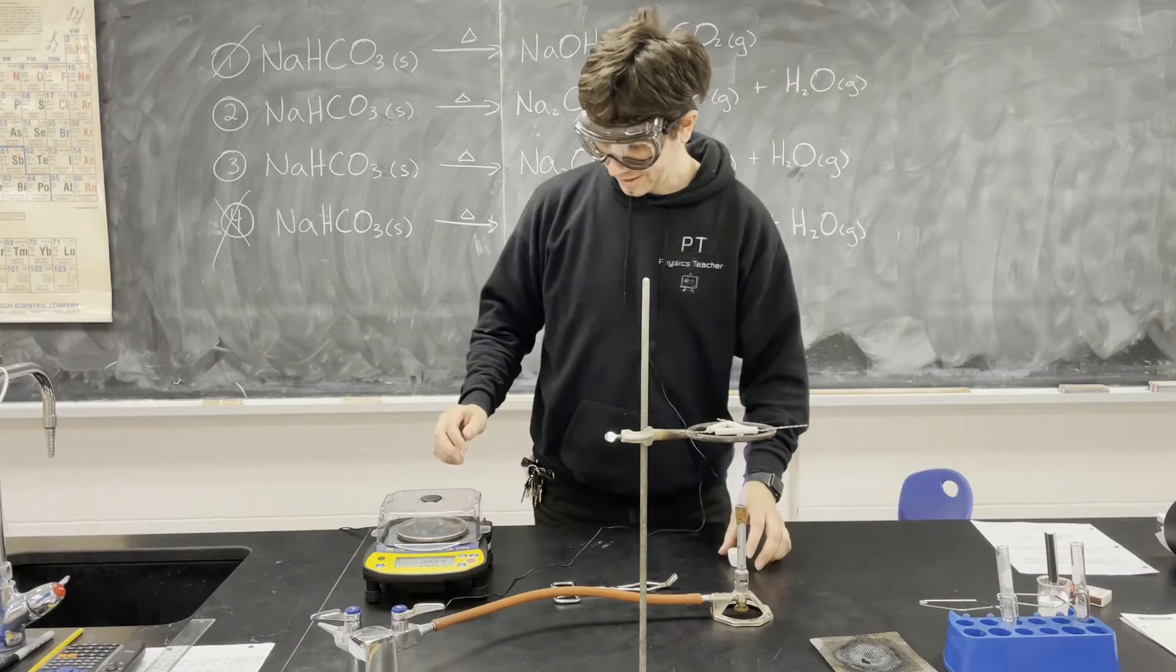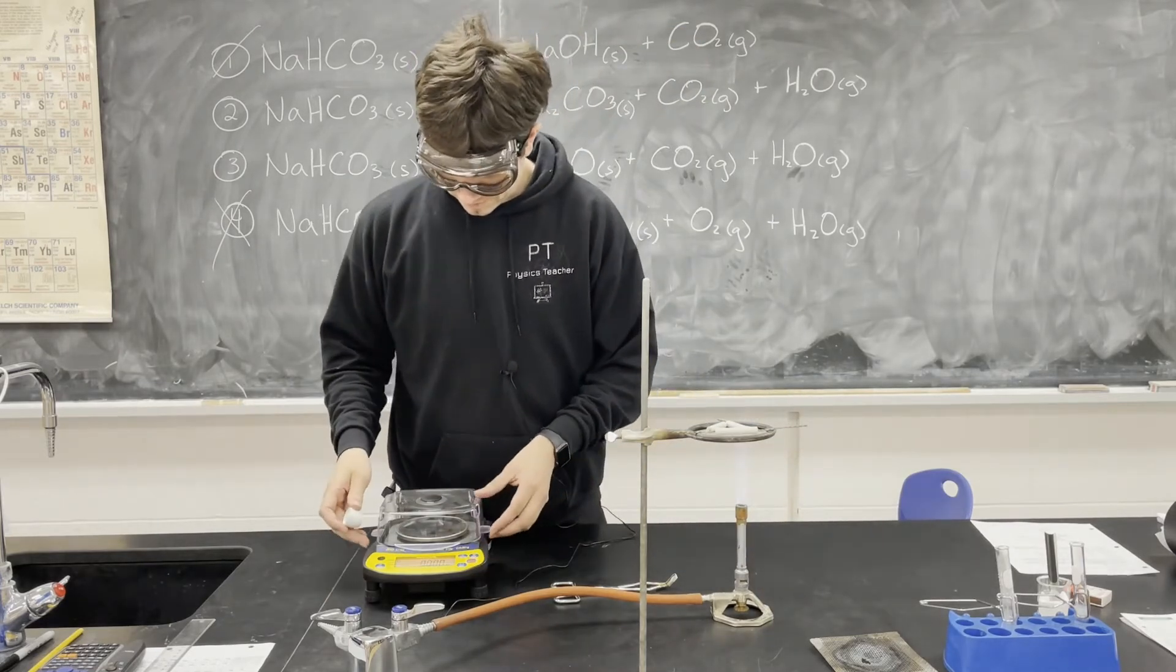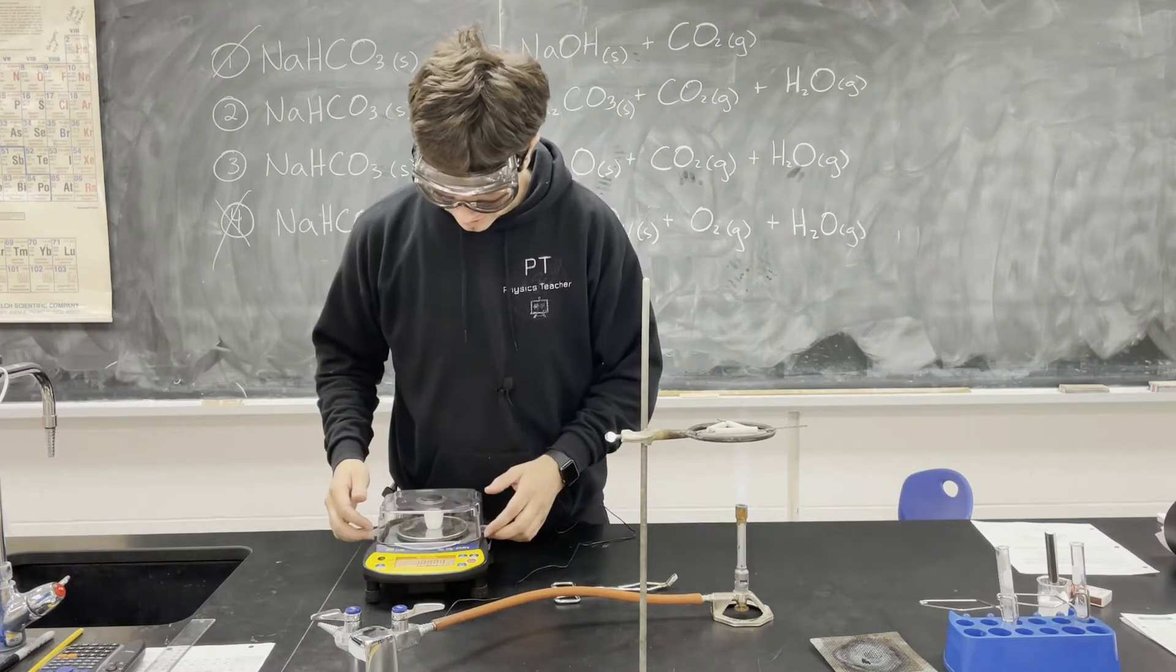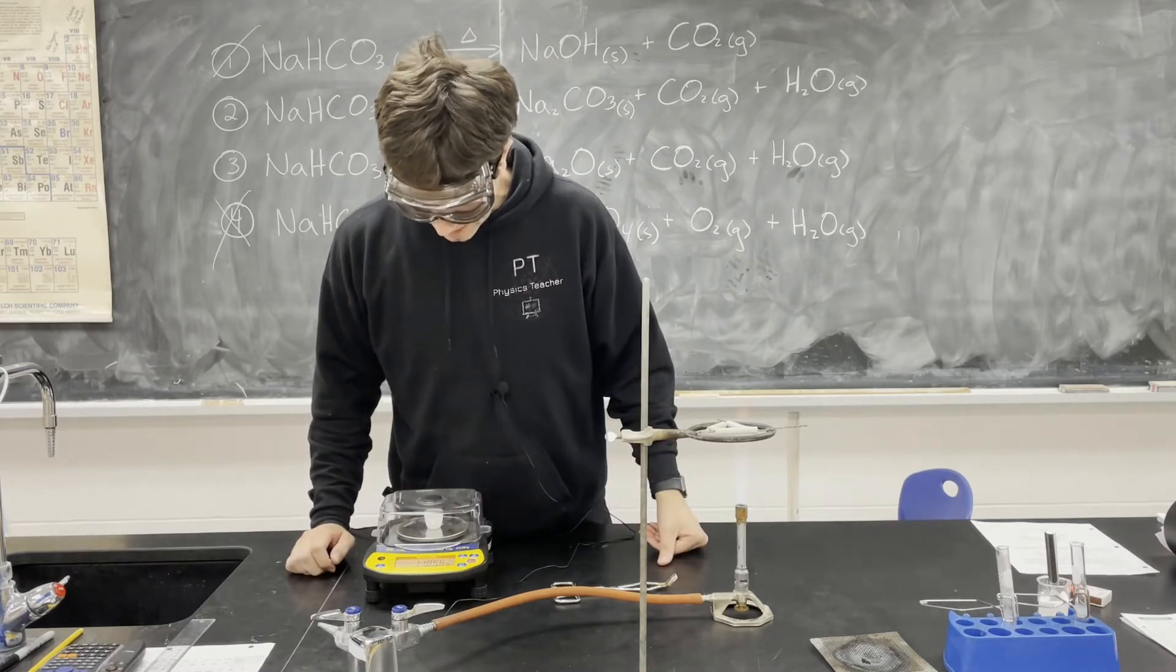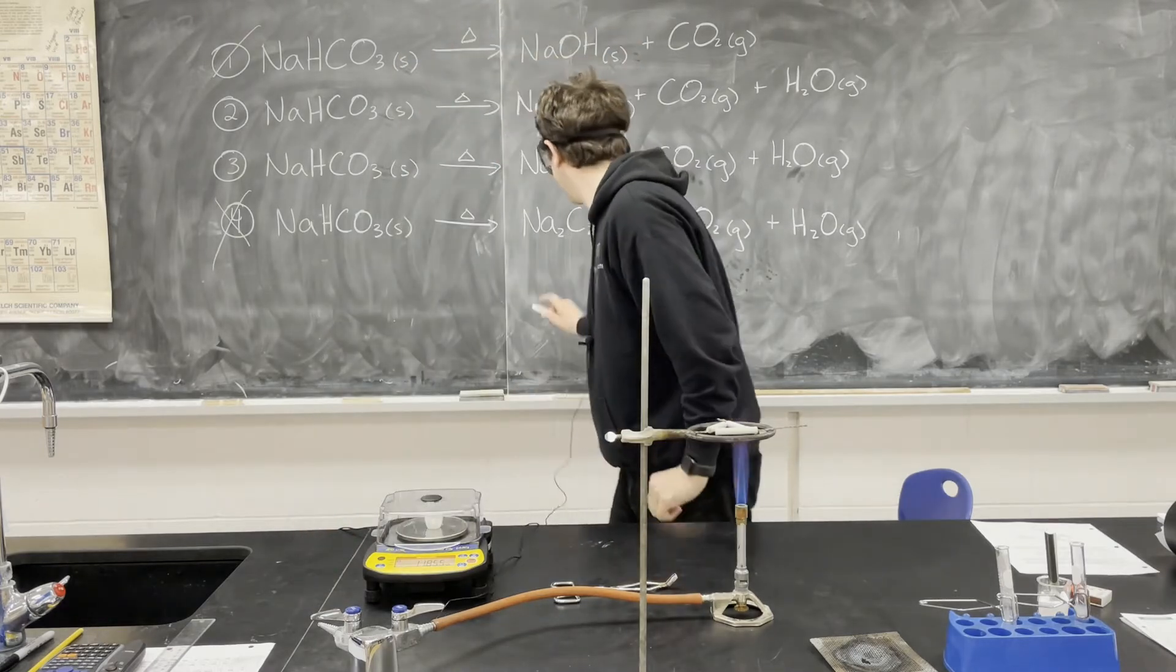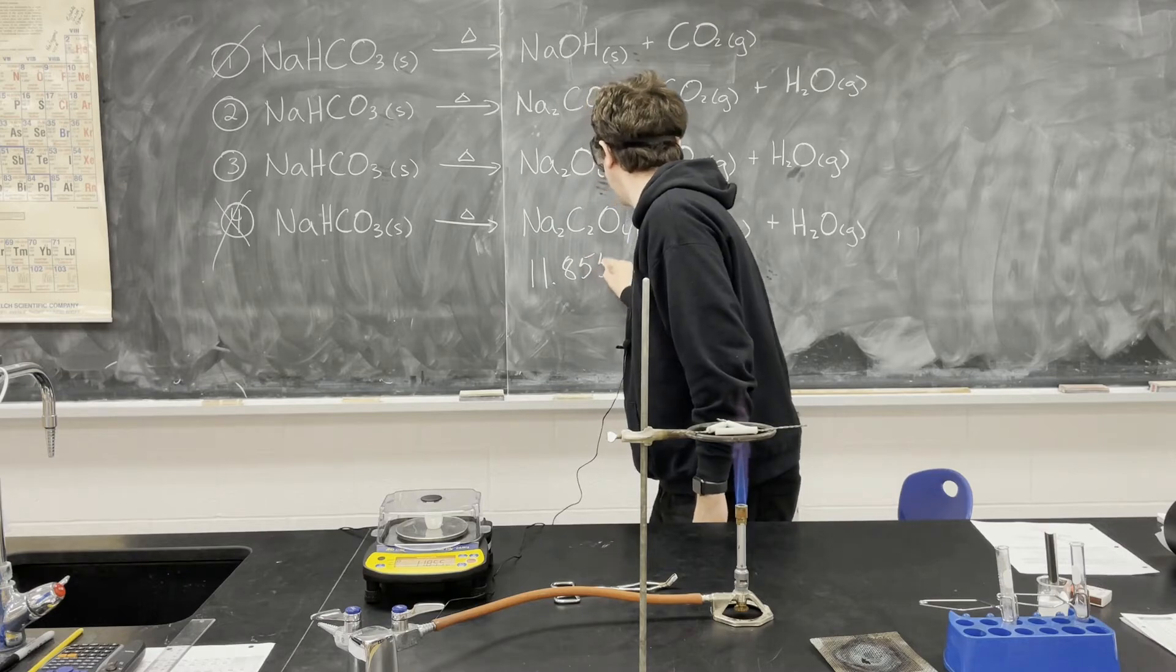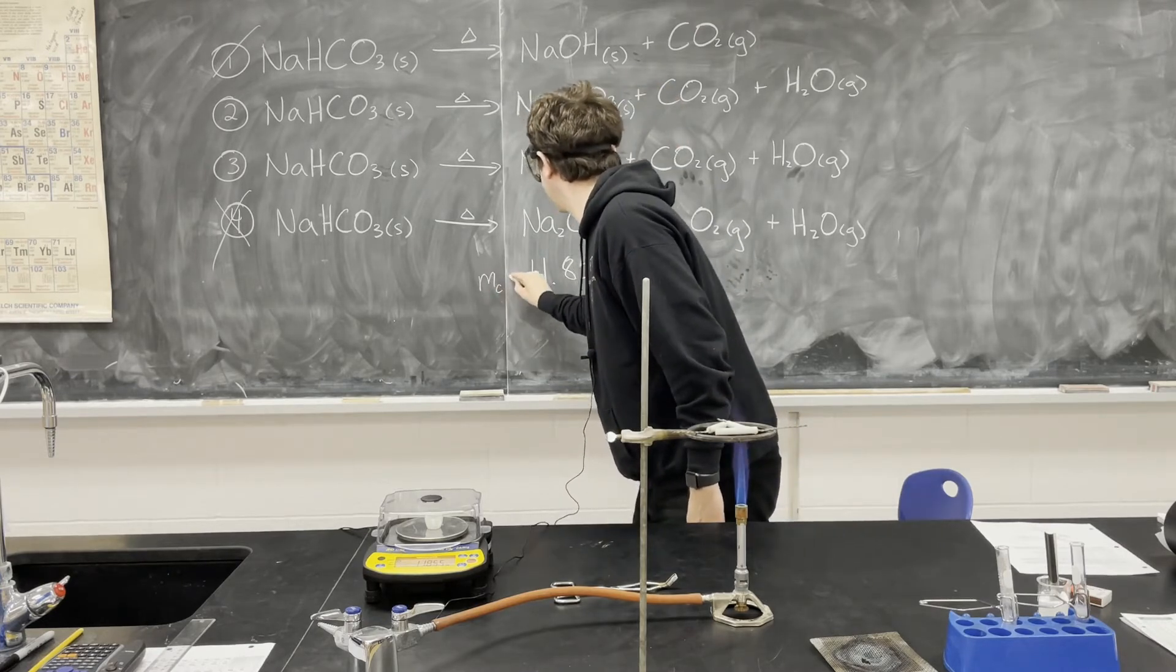So, let's start. We'll go zero. The mass of the crucible is 11.855 grams. So, mass of the crucible, 11.855 grams.